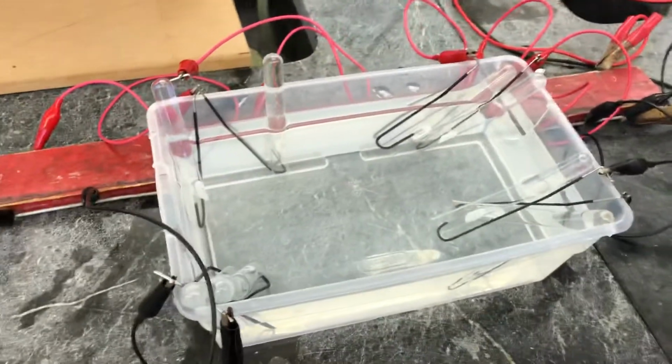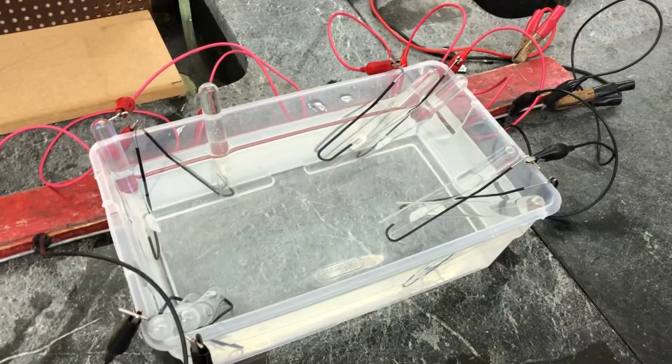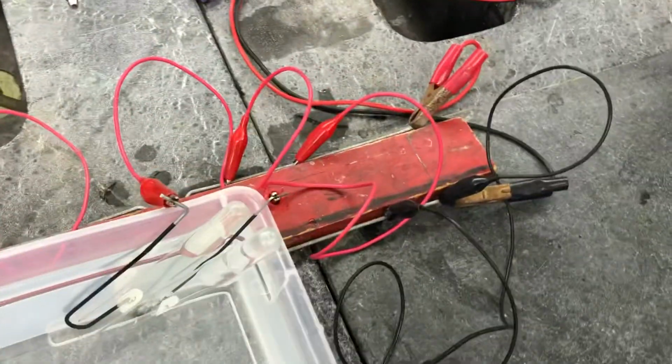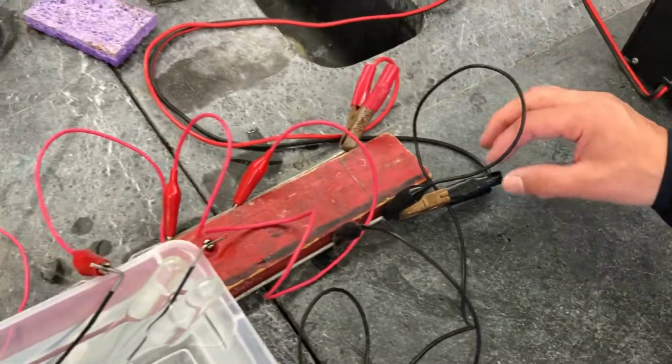So here in part one, what we are doing is we are using electricity to split water into its two atoms that make it up, hydrogen and oxygen. On this board, with electricity, we have a positive electrode and we have a negative electrode. The positive is red, the negative is black.